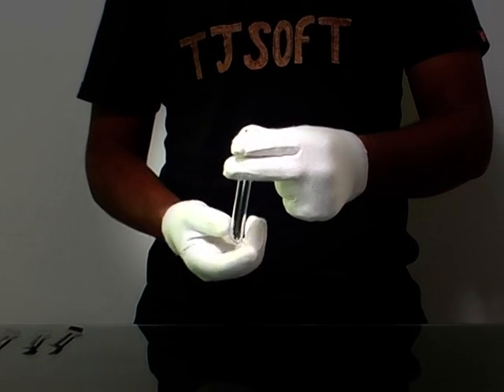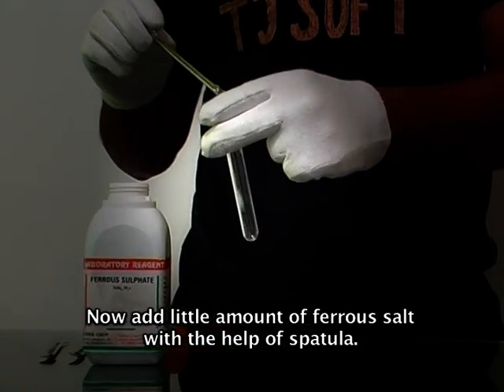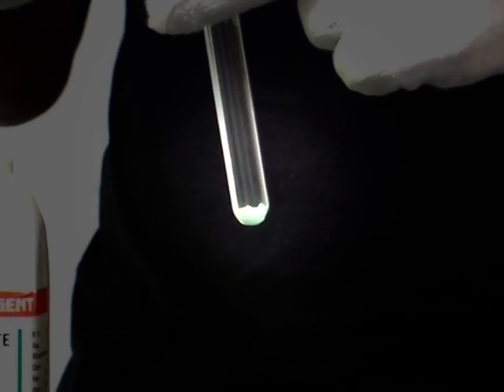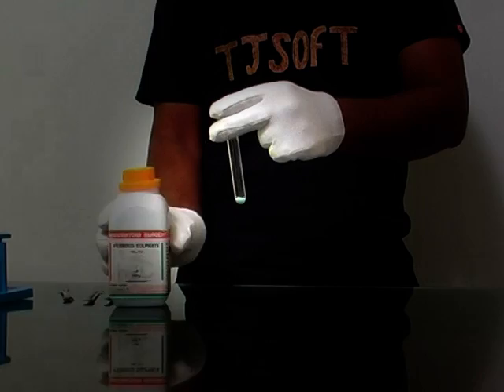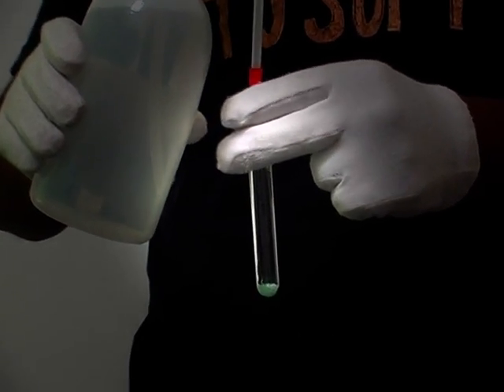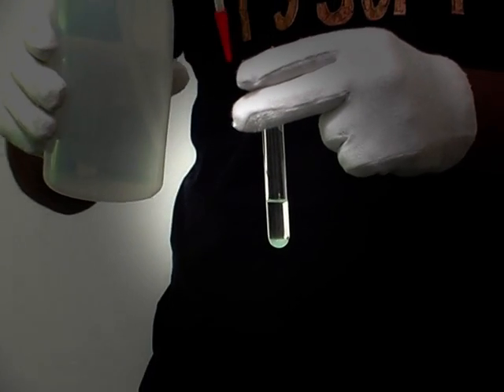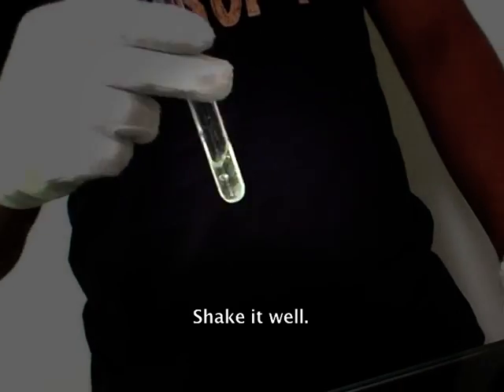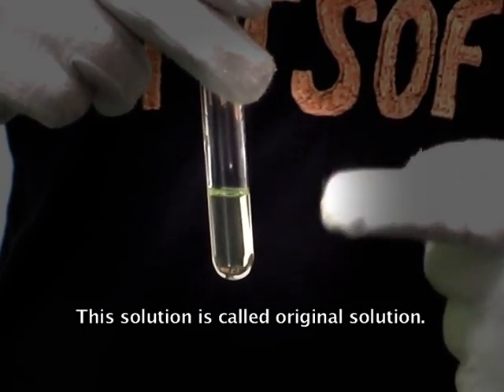Take a test tube. Now add a small amount of ferrous salt with the help of a spatula. Now add cold distilled water. Shake it well. This solution is called the original solution.